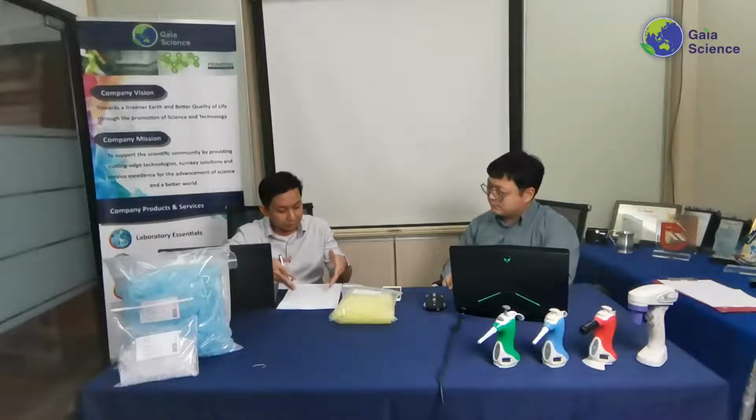So I guess put it this way, of course, bulk is cheaper compared to rack. It's not to conclude that one, but it's cheaper than rack. But then, if you're using bulk, it will take you a lot of time to put it in the rack, so it will be costlier because you spend more time doing what your student do, right? Yeah, I think it's a good point there.